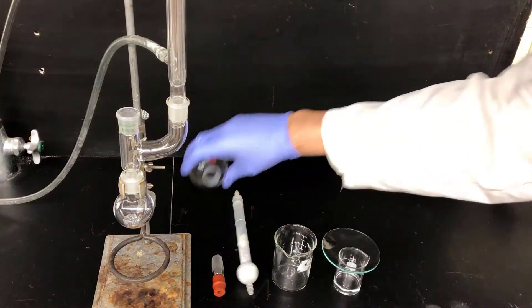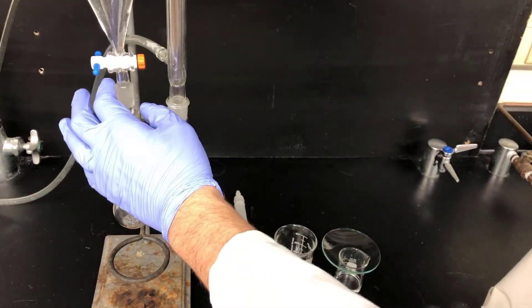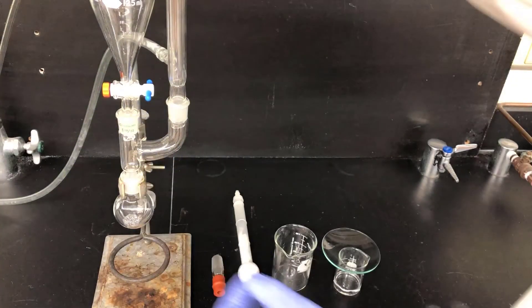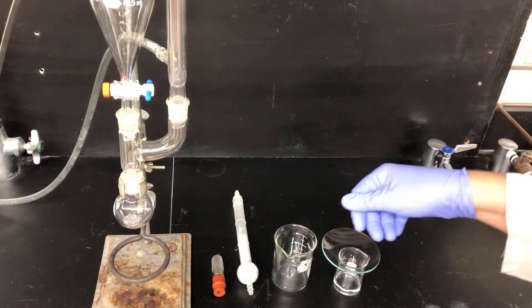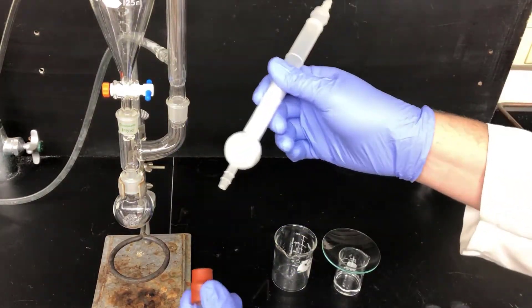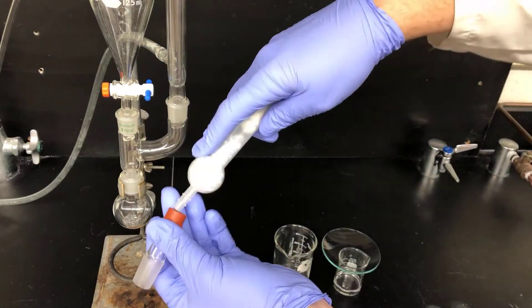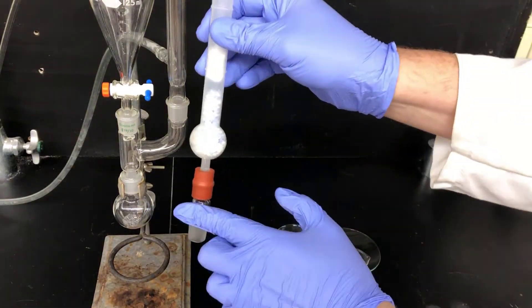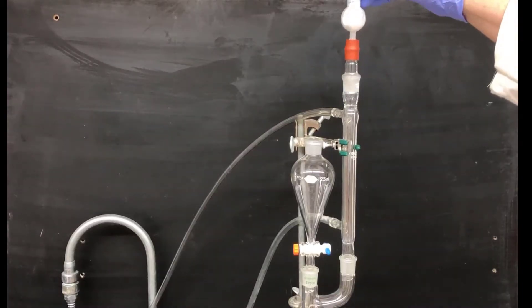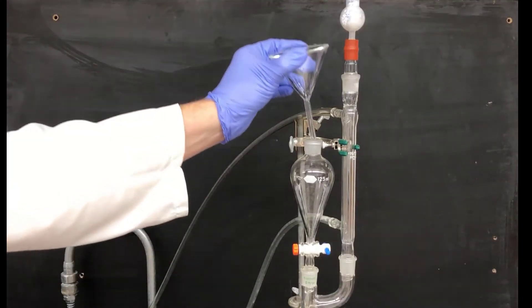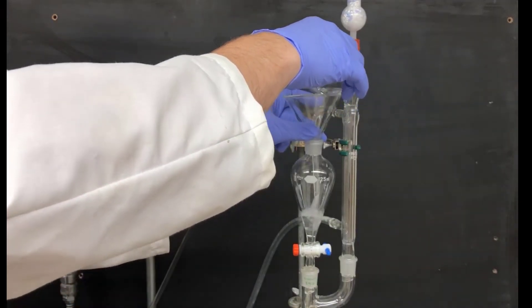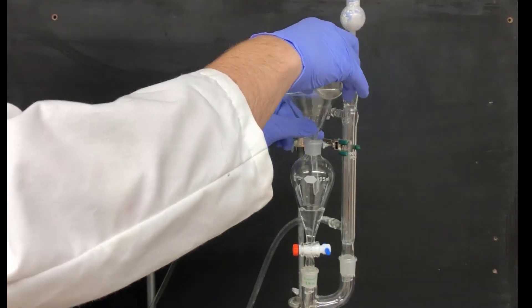Now I'm going to plug the separatory funnel into the other open port on the U-shaped adapter. This separatory funnel is going to get used as an addition funnel. It's going to allow us to add bromobenzene solution a little bit at a time. Now I'll take the thermometer adapter and plug the drying tube into it through the rubber boot. This will allow me to connect the drying tube to the top of the apparatus, as shown here. Now I'm pouring the bromobenzene solution and ether into the separatory funnel to allow me to add it slowly to the magnesium in the flask below.